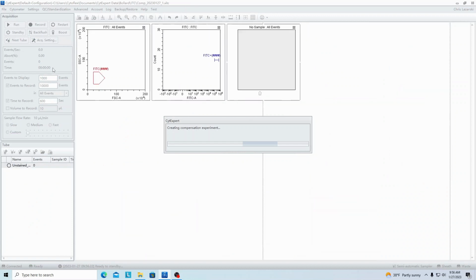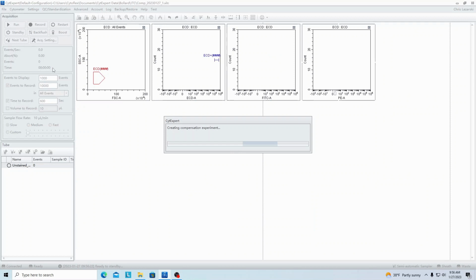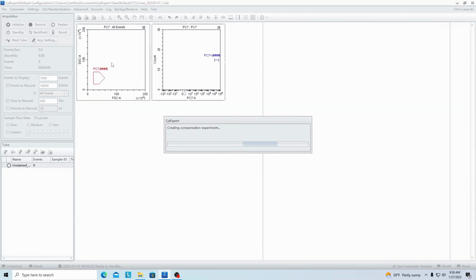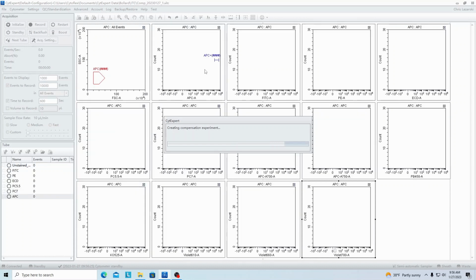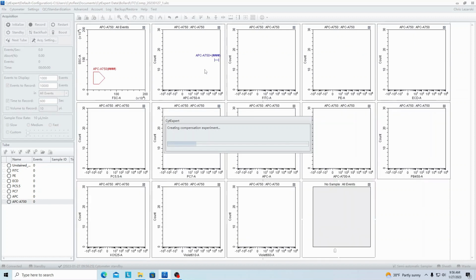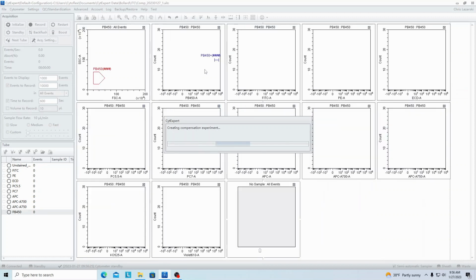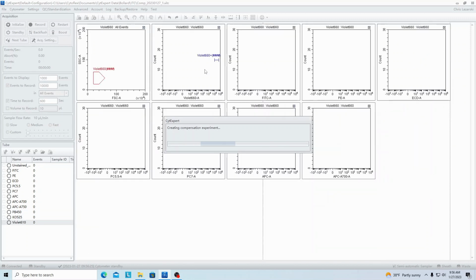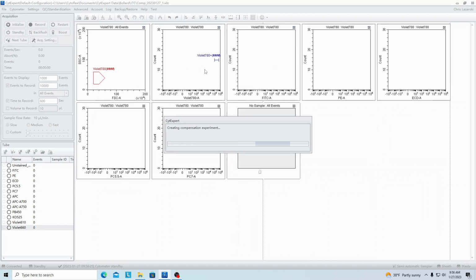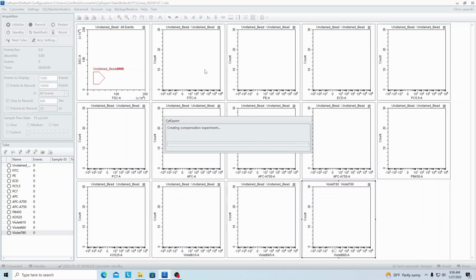The instrument creates the new experiment, and it creates histogram windows for all of the colors involved, with a sizing gate to find your beads and a histogram intensity gate to find the peak intensity for the bright positive cells. We have an unstained bead control in here, which then will be used as a negative peak.